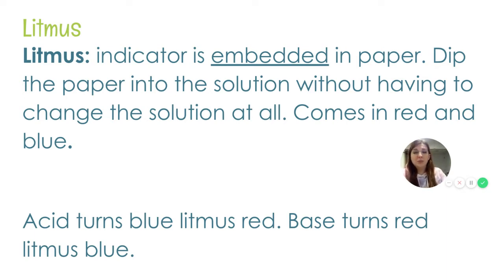There's also something called pH paper, which is usually like this ugly goldenrod yellow color, and that gives us a little bit more specific pH ranges. I think it's a few shades of green, some blue and purple, some red and orangey colors, and then you hold it up to the little tube that it comes in, and it'll tell you sort of close to the pH. So we like these because we don't actually have to add them to the solutions. It's just a dip test.